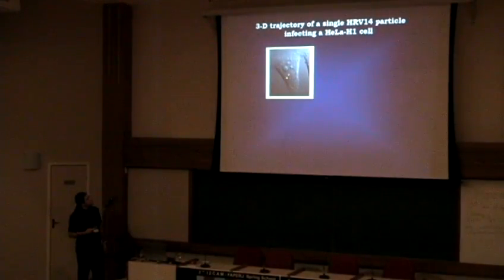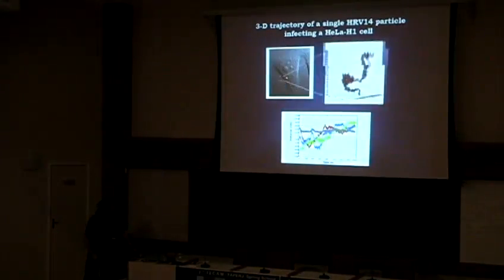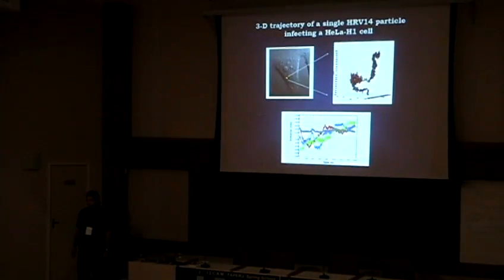And this is the projection of a trajectory on the 2D image of the cell. Wow, nothing. There is not much information there. But this is the 3D trajectory. Actually, it moves a lot in Z. A lot. And this is not observed at all if you do the camera tracking. You cannot observe this movement. Most of the movement is on the Z.